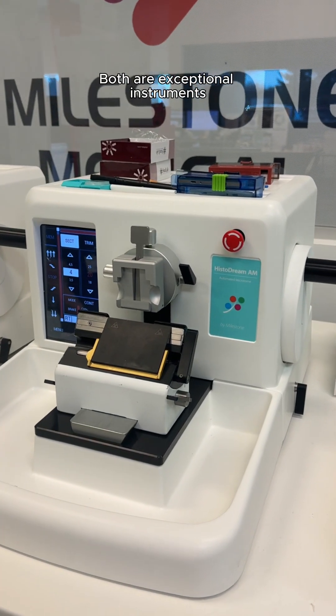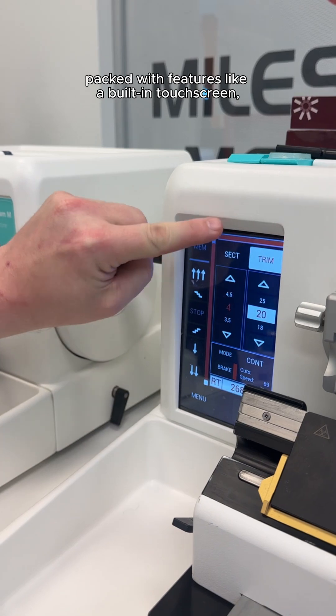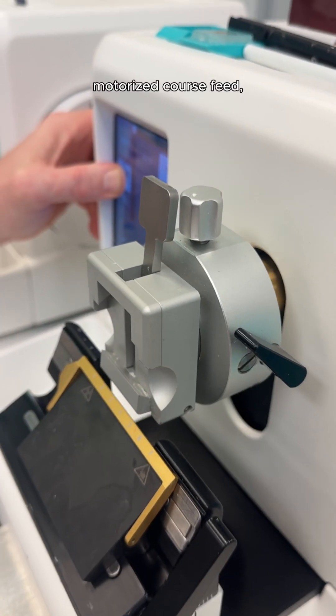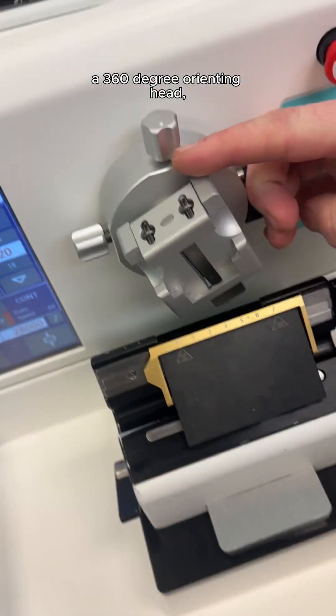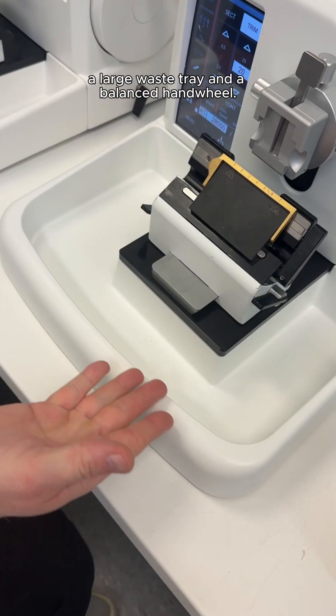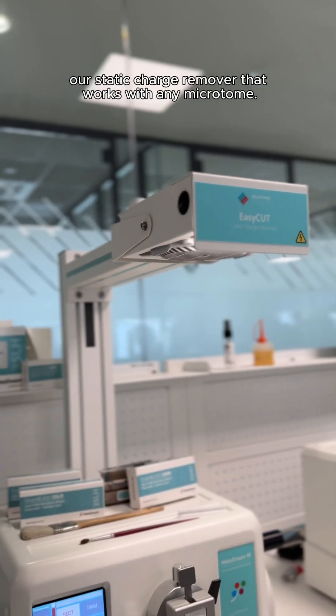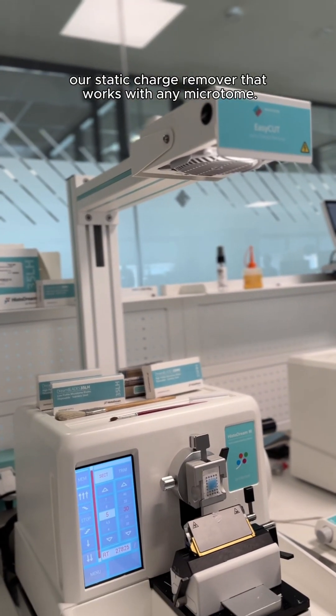Both are exceptional instruments packed with features like a built-in touchscreen, a sideways sliding blade holder with a finger guard, motorized coarse feed, a 360-degree orienting head, a large waste tray, and a balanced hand wheel. They're also both compatible with EasyCut, our static charge remover that works with any microtome.